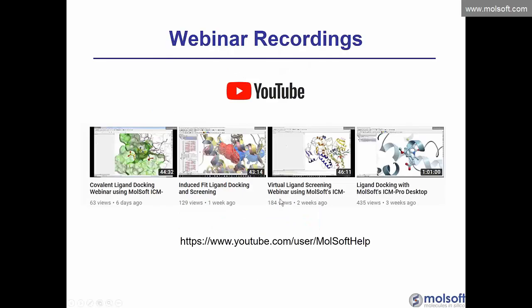Just as I mentioned, on YouTube, you can catch up with the last 4 webinars in this series. The first one is probably the most important because we skipped some of the steps in this demo because they're covered in this one. Ligand docking with MolSoft's ICM-Pro software explains how to set up the ligand and the receptor. This webinar explains how to screen and score millions of compounds to a protein target using virtual screening.